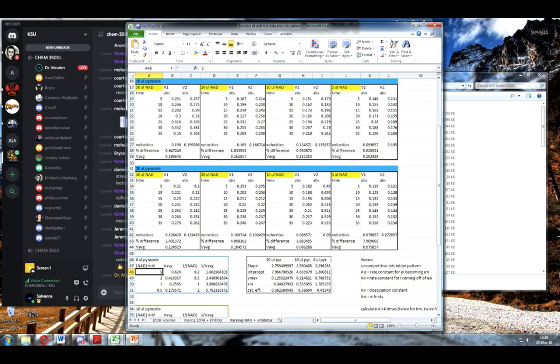Right? If you wanted it in molar, it'd be 0.005, and we convert it to millimolar. That's what we want to report it in. The average velocity still has units of per minute. We haven't changed anything about that. I recorded them over the same times, so times 60 still results in per minute.